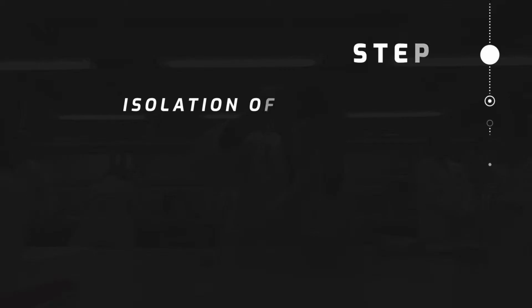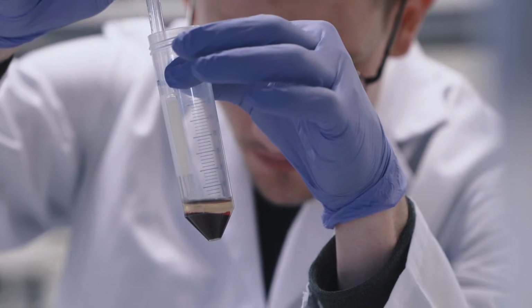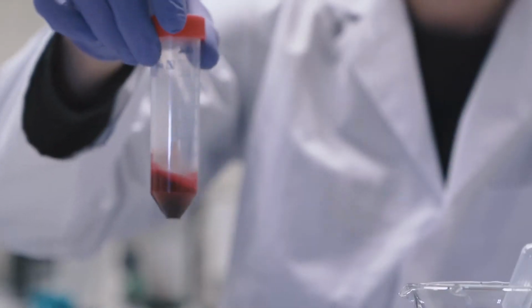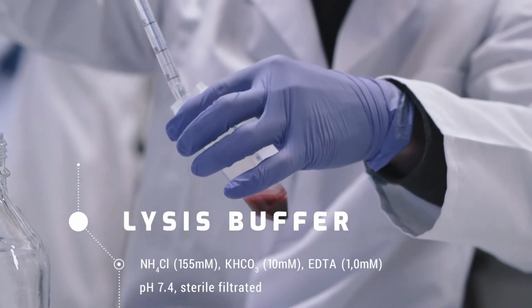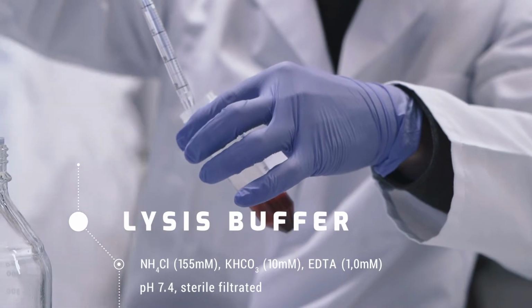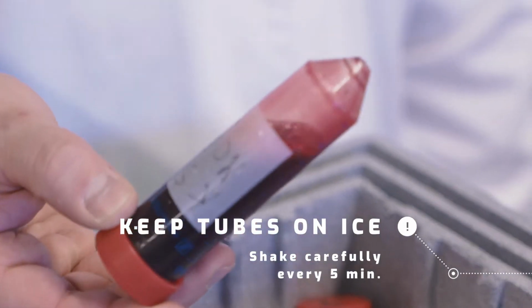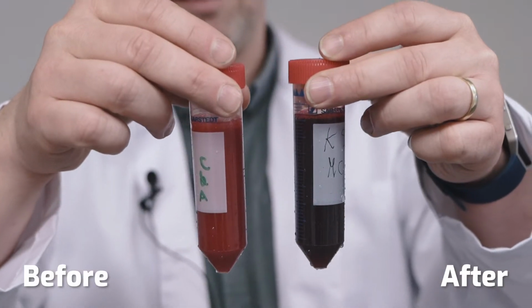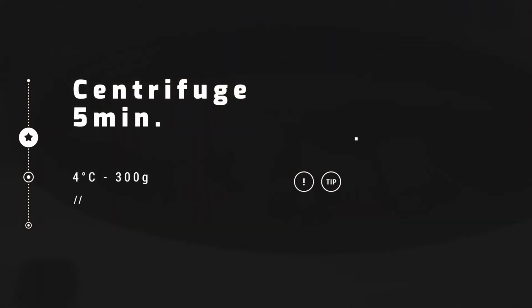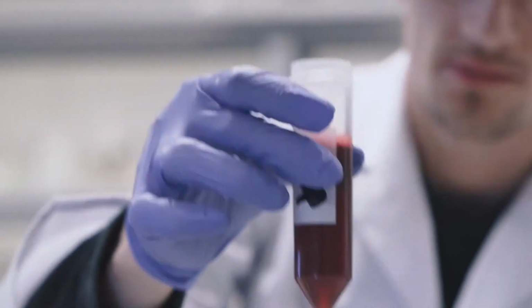If you want to isolate the granulocytes, you have to remove most of the liquid on top, and then you resuspend your red blood cells in the remaining solution, and then we add 3 volumes of ice-cold lysis buffer. Lysis buffer specific for lysing erythrocytes. So after lysing the red blood cells, we have a nice white pellet, and you can discard reddish cells just by decanting.